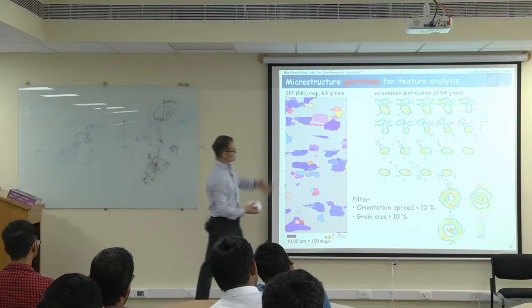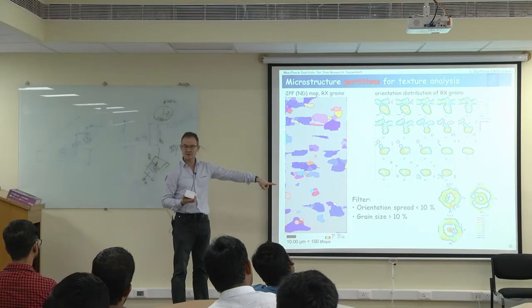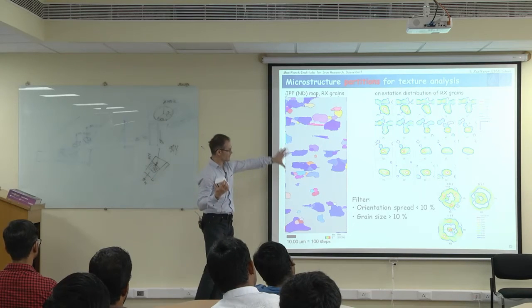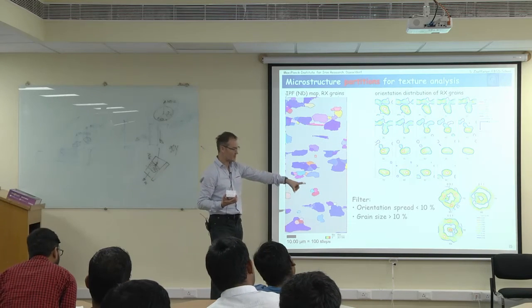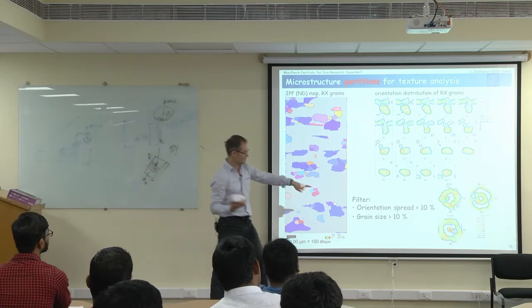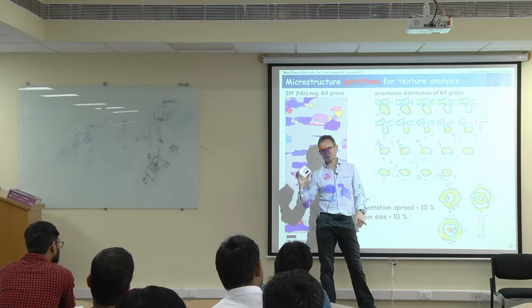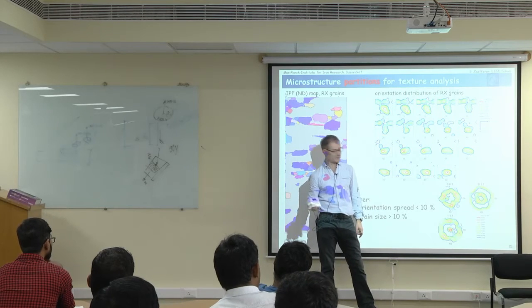Now you could ask the question: is this enough grains to make sure that this is really true? It's probably not. So I would go and make a second map, look at least one more map, and see whether these peaks come out again at the same place. If it comes out, then I start feeling this seems to be good.